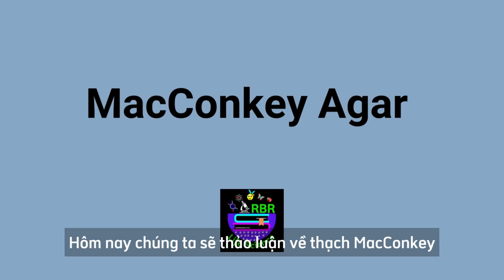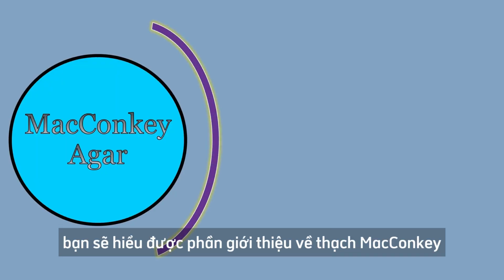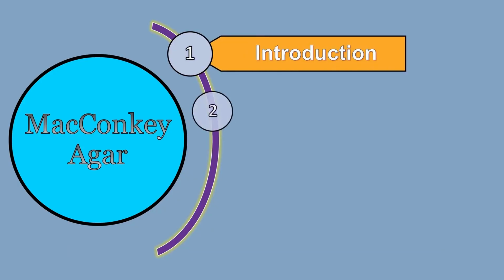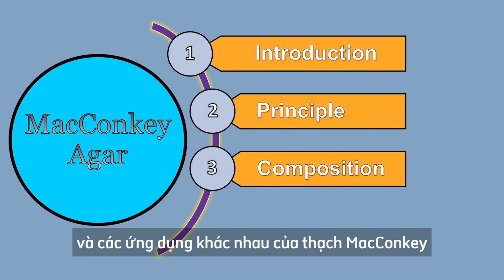Today we are going to discuss MacConkey Agar. After watching this video, you will be able to understand the introduction of MacConkey Agar, the principle of MacConkey Agar, and the composition and different uses of MacConkey Agar.